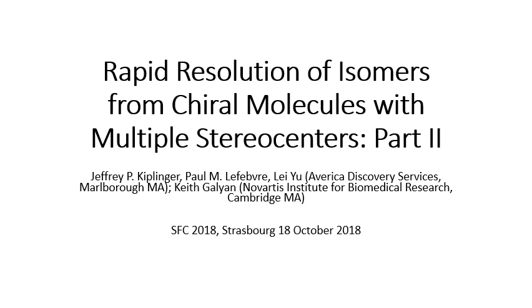In part one of this presentation, we ended on an example of a 2-chiral center molecule and a complete resolution of all 4 individual isomers from that molecule using chiral SFC. Let's take a look at another example.